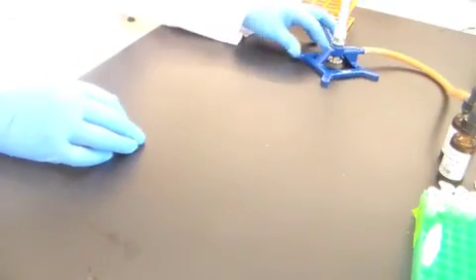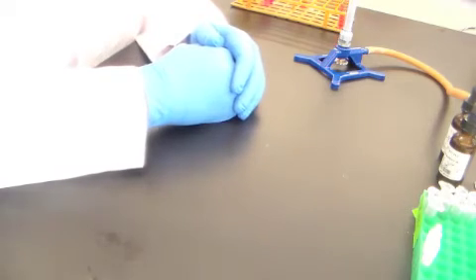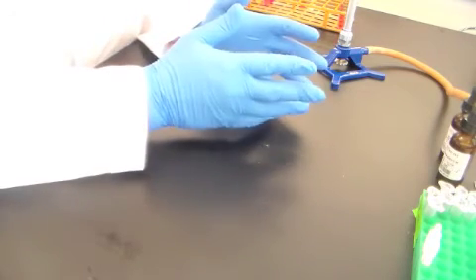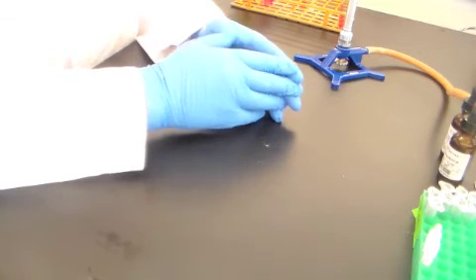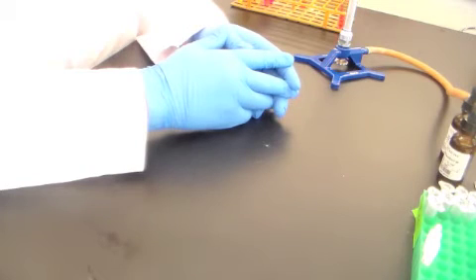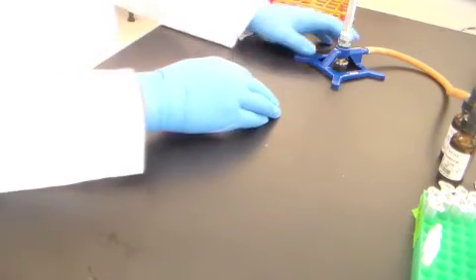This week in the laboratory, you're actually going to just be inoculating a lot of different media. We're getting close to doing the unknowns, so this week is a big push in terms of inoculating different media. And I'll explain more about the basis of these media next week when we actually have the results for them. And for the most part, you're going to be inoculating plates, streaking for isolated colonies, so it'll be good practice for your isolated colony techniques.